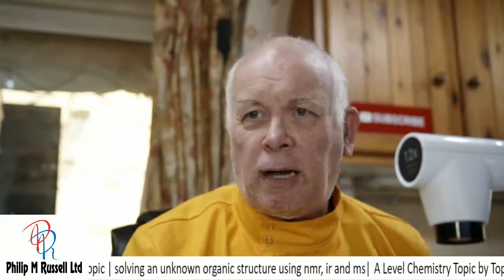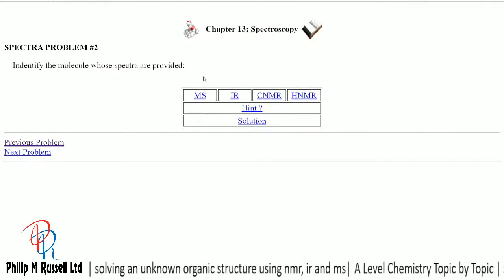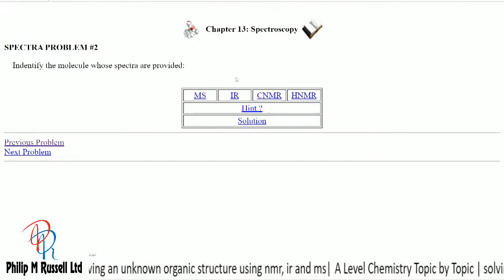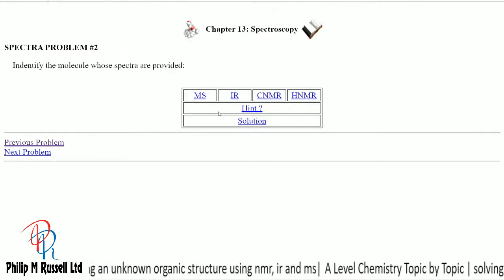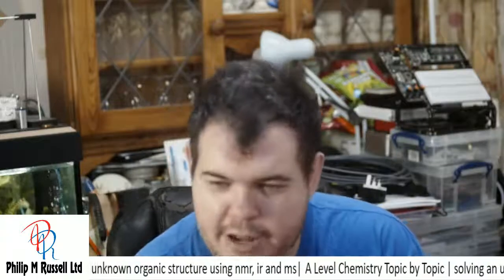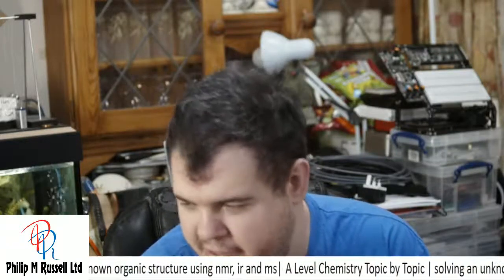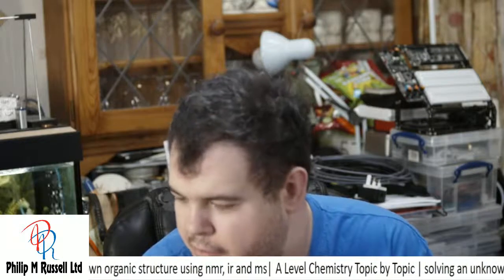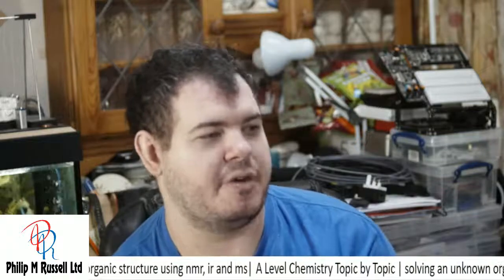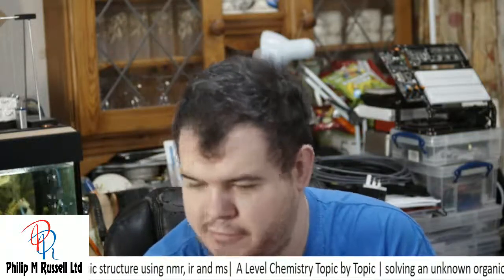Okay, so we're going to have a look at our second problem here. Right, so you started in the order they give you, which is mass spec, IR, whatever. That's fine, except you really want to get down what your functional groups are. That's the first thing you actually do, because knowing the functional groups, you can then confirm those in the mass spec. Without knowing what you've got, it's a bit nuts.